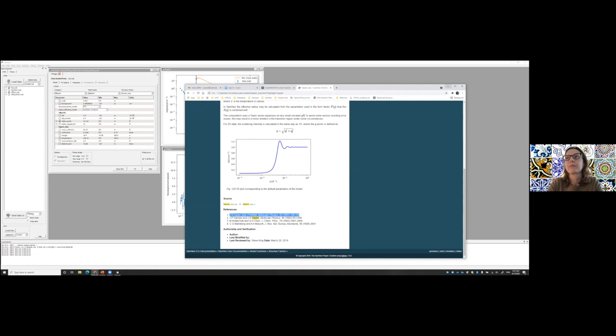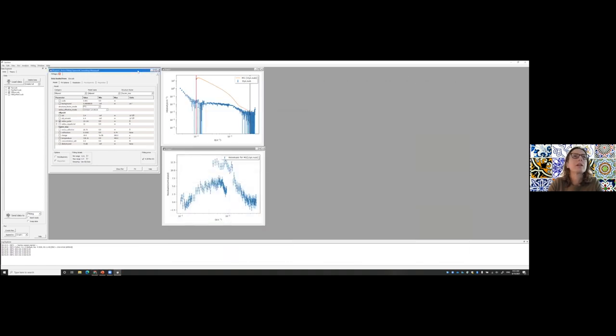So for example, let's go back to my SASView. Hopefully you can kind of see. For example, in your model, you have a radius effective, you have a volume fraction, a charge, temperature, concentration, etc. And if you read the reference, it tells you that when you combine it with a form factor, you should set the scale parameter to 1, because remember this scale is a volume fraction, but it's a multiplying factor in that magical equation of ours. So we don't want to apply this scale twice. And you see that your structure factor already has a volume fraction parameter of its own, right? So you should set this to 1. Again, the reference tells you to do that. This is why it's important to read about it.